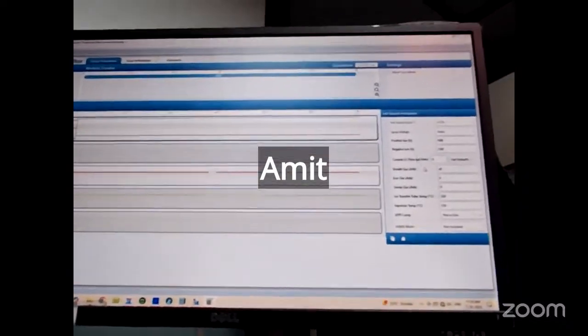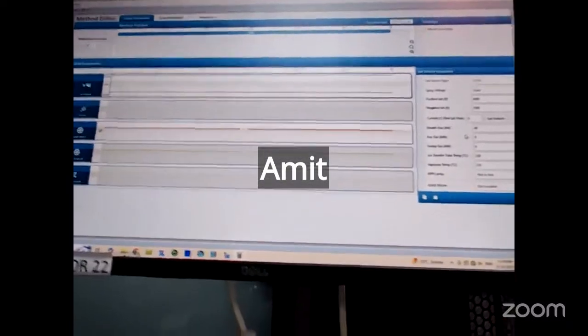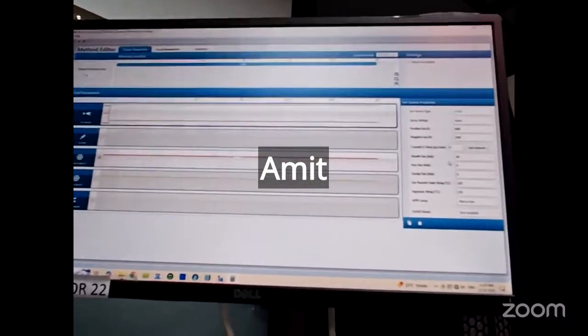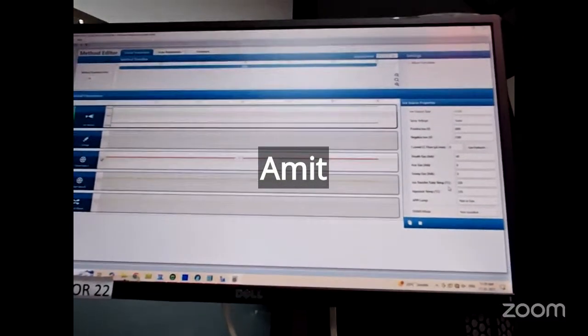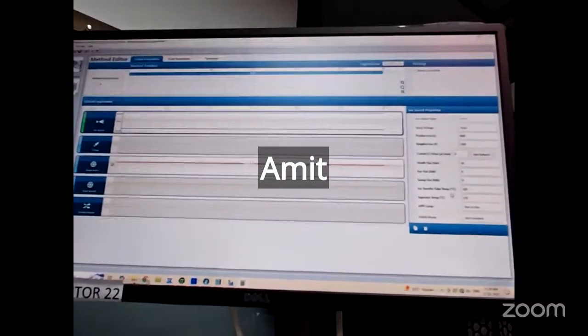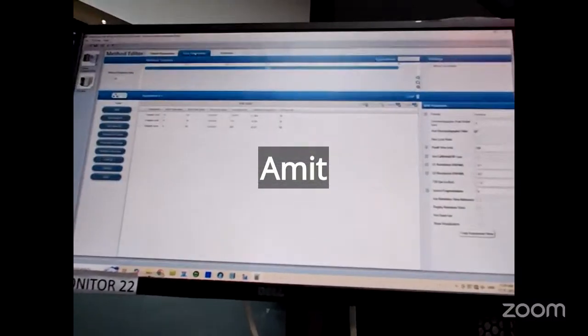Then we have the different gases that help the liquid turn into ions and guide how the ions move into the analyzing system, followed by the temperature. This is the ion transfer capillary tube that leads the ions into the source or mass analyzer. After this, we need to give the scan parameters.